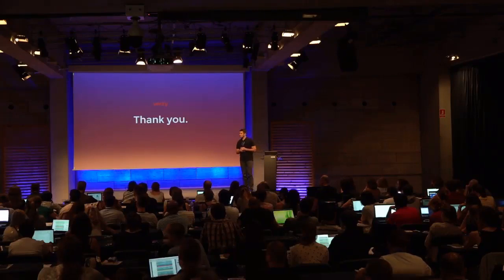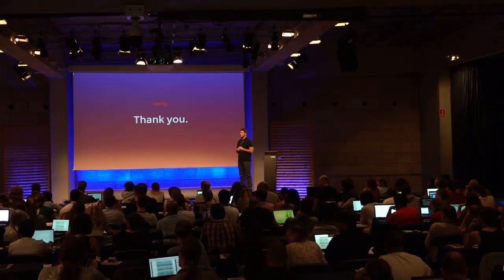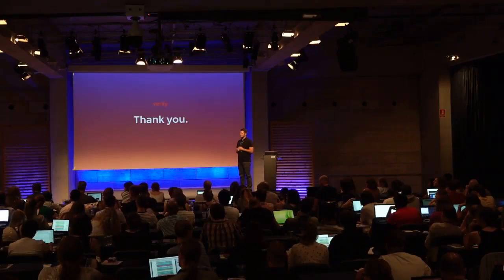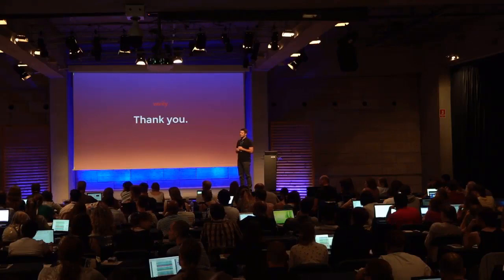Great talk. Really nice work. So I was wondering whether, if you compare it to direct DIA or have thought about integrating it into your model, maybe this could get even better, right? By direct DIA, you're referring to the tool that Biognosys offers, Spectronaut? No, direct DIA in comparison to DeepMass.